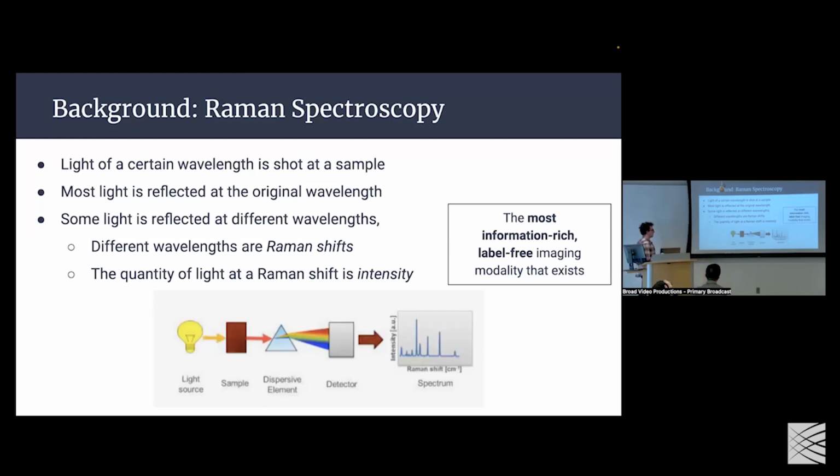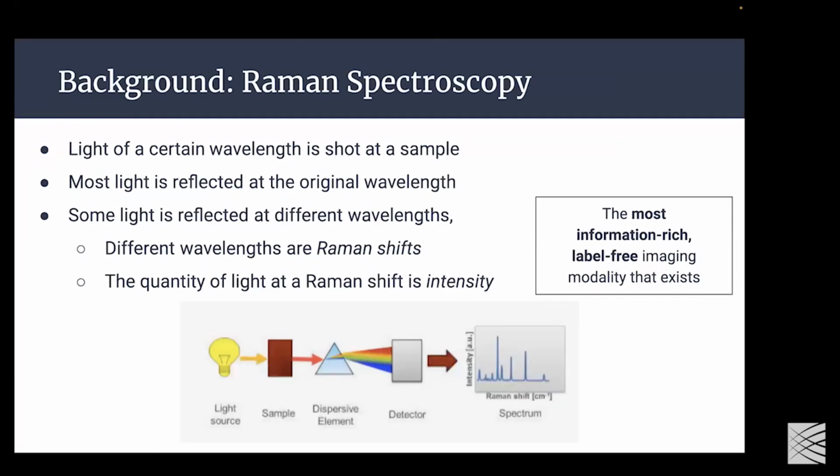And more or less what it gives you is a greater insight into the biomolecular composition of a sample. It's very information rich. It's label free. You can use it to track live cells, which is the motivation for the work I'll be talking about. Very cool modality.